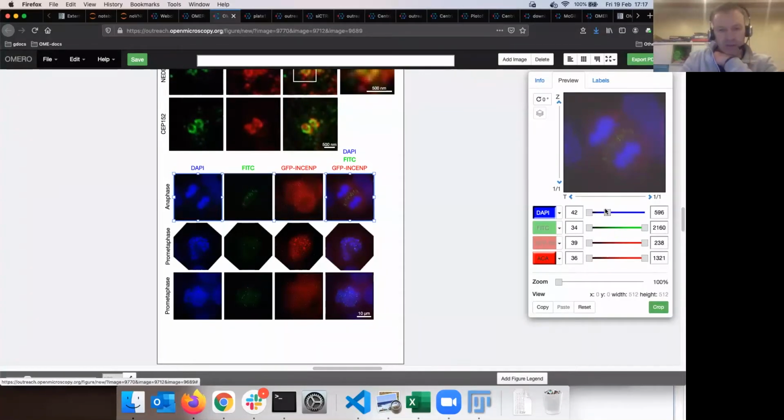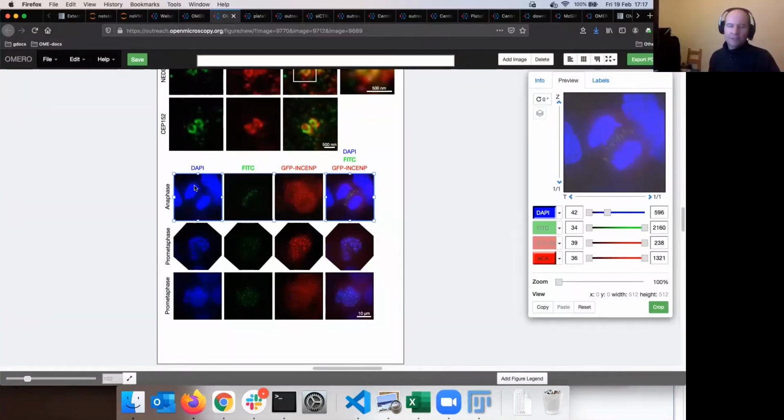So if you change the setting for that blue, that will apply. That would be a way of copying, if that's what you are talking about, but you will have to do that channel per channel if you wanted to have exactly the same thing. That's kind of the only way you will be able to do that. Yes, but you could have done that to start with.